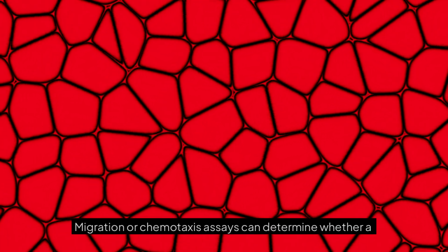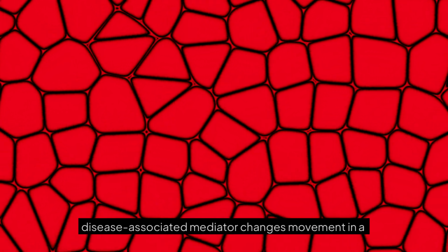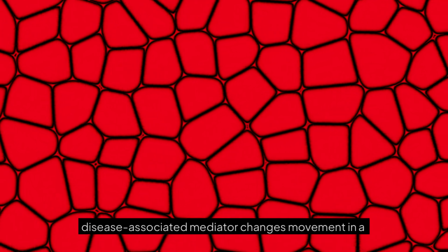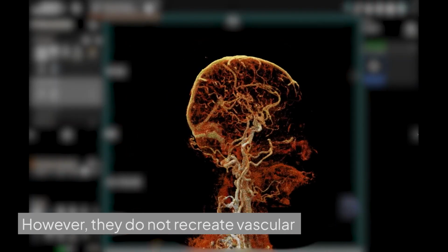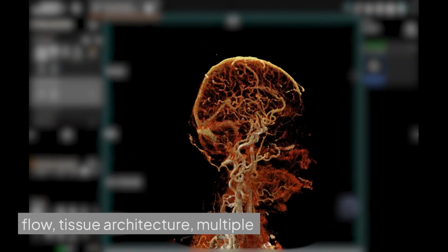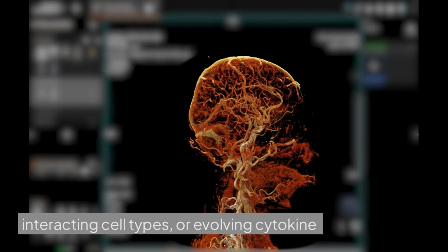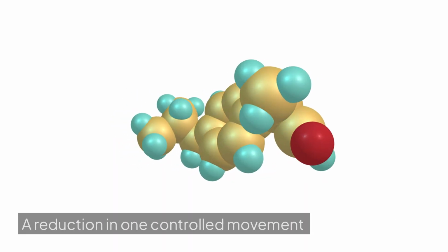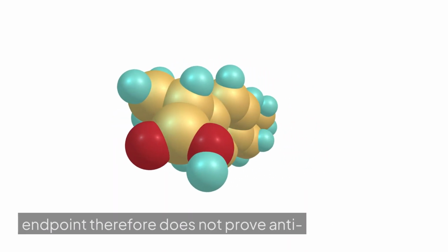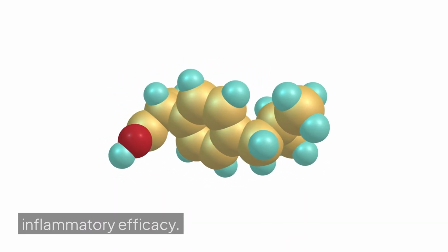Migration or chemotaxis assays can determine whether a disease-associated mediator changes movement in a selected immune or stromal cell model. However, they do not recreate vascular flow, tissue architecture, multiple interacting cell types, or evolving cytokine networks. A reduction in one controlled movement endpoint, therefore, does not prove anti-inflammatory efficacy.